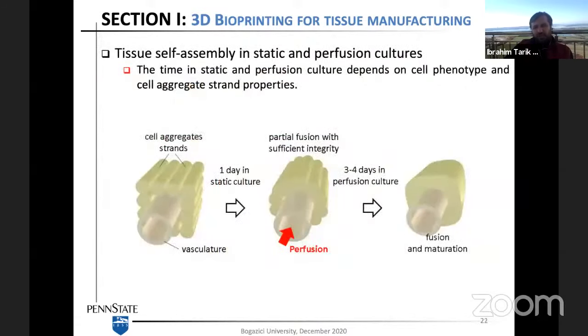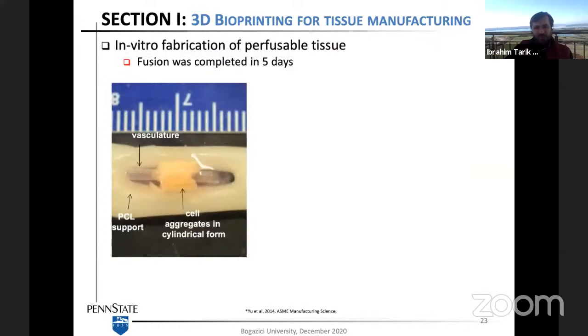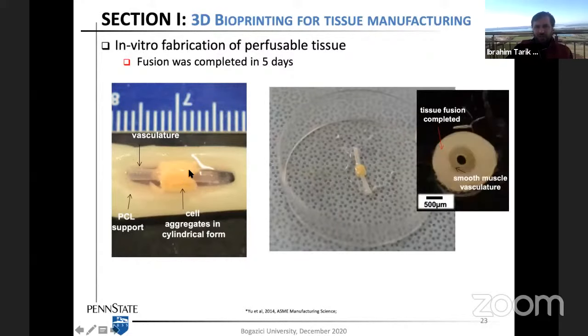Then we combined that with the tissue strand printing. This was an interesting concept where we print these tissue strands. As you remember, the tissue strands have the self-healing or fusion capability. So we printed these with the vasculature in tandem, and over time we expect that in a couple of days these tissue strands self-assemble and enclose the vasculature in full. This is the experimental image where we use a support structure, just to support the entire structure until the fusion completes. After printing, we see that we are able to make a stromal tissue that is enclosing a vasculature. And this could be used for various purposes, like disease modeling, or even for transplantation.